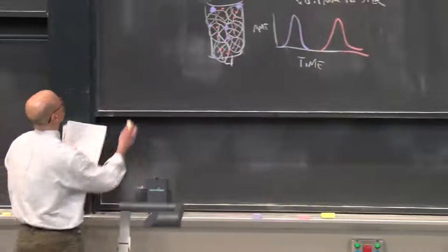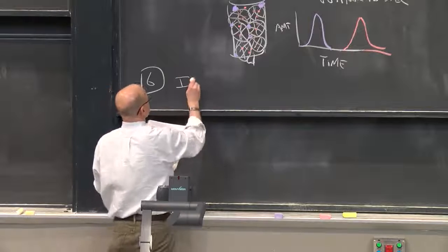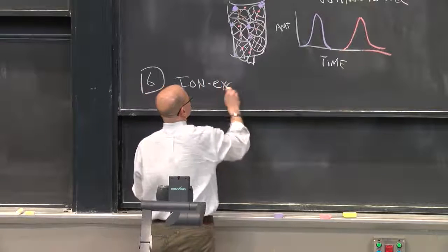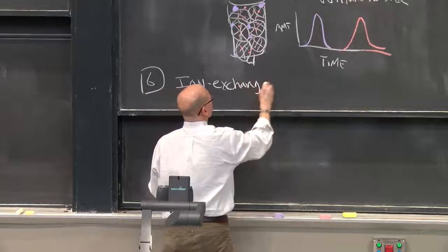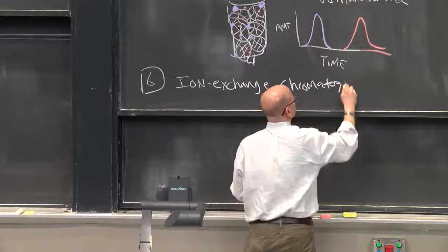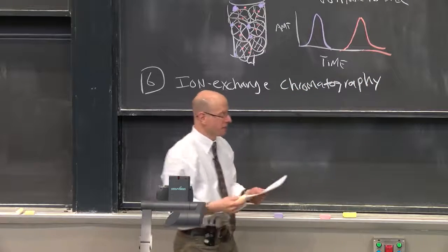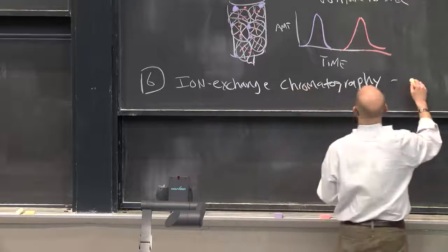How about separation based on charge? I can do that too. And the technique I'm going to use to separate based on charge is called ion exchange chromatography. Ion exchange chromatography. Now remember, it separates based on charge.